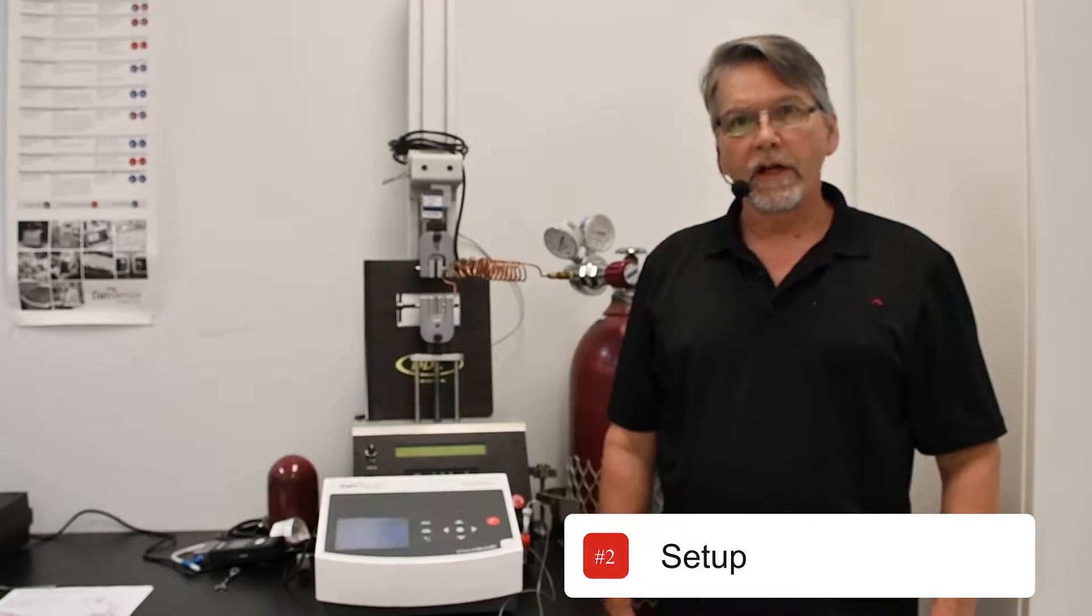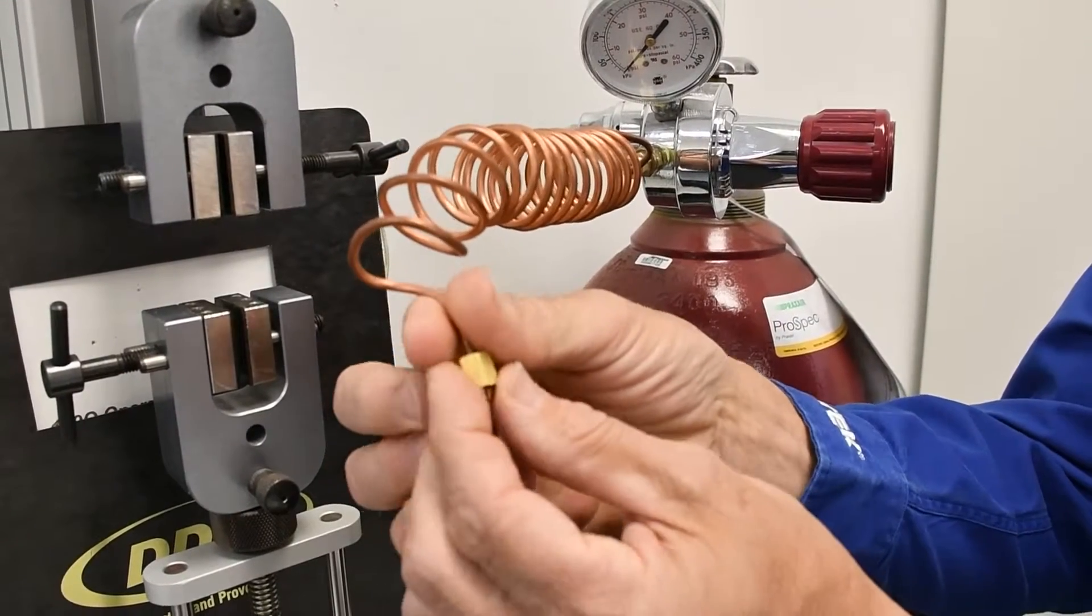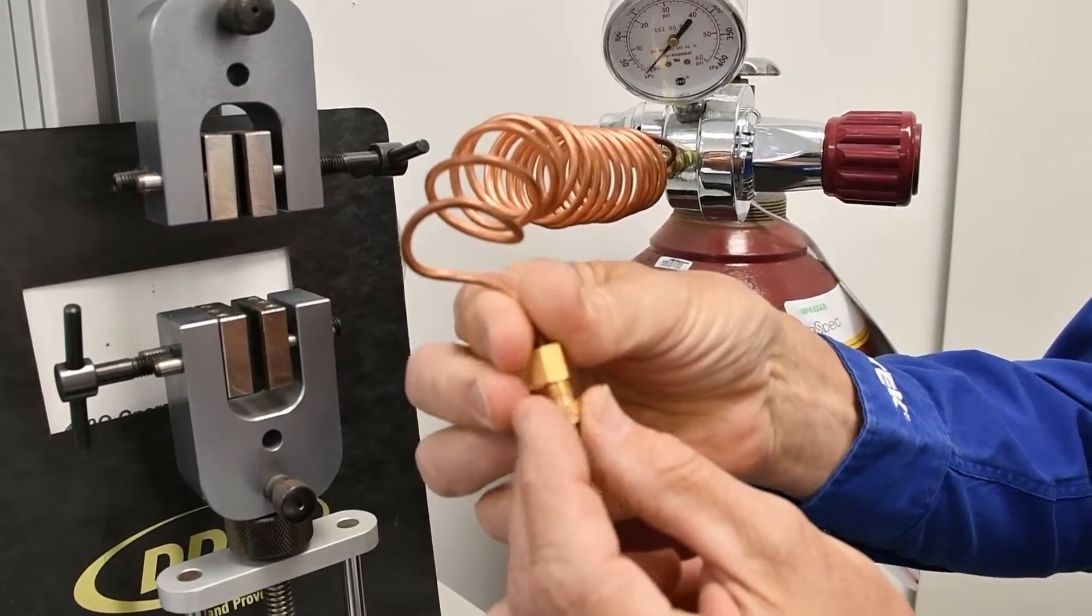Here's the setup for the Checkmate 3. Connect the gas tank regulator to the pressure relief kit via nut, ferrule, and copper tubing.